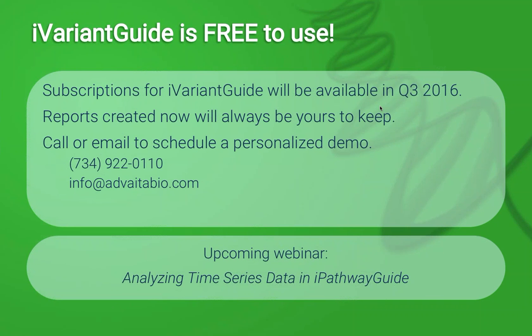Just to reiterate, here's a question: what's the max size of a file that you can upload? The max size would be a VCF that's not zipped at 100 megabytes. Regardless of size, we recommend that you keep the number of variants in your file below 200,000. This is to make sure that the filters work as quickly as they're supposed to, so that you get that immediate feedback that's so critical.